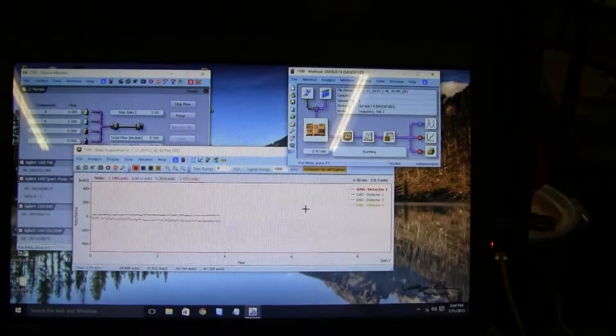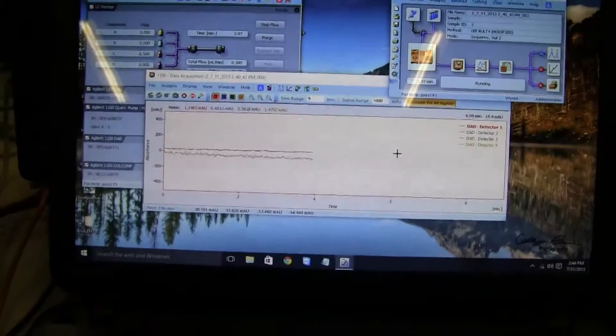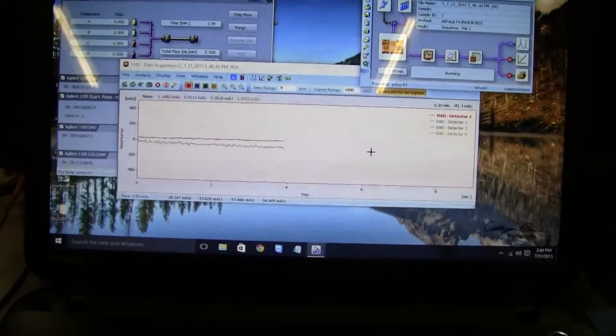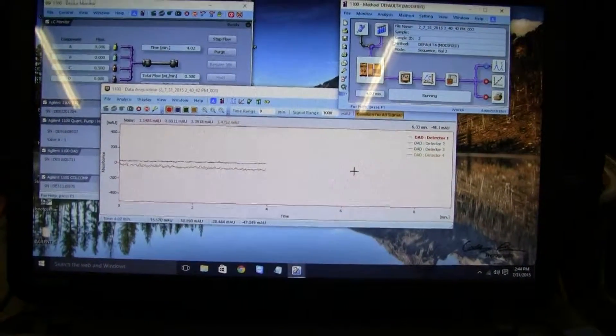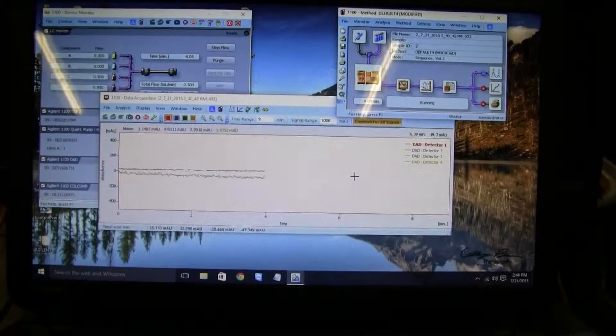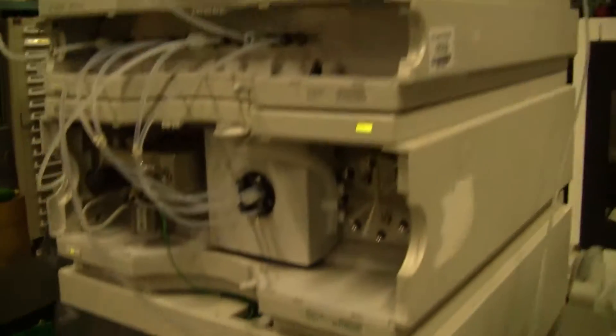Going back to our current run, we look forward to seeing that data reproduced right here. So, everything's running quite smoothly.